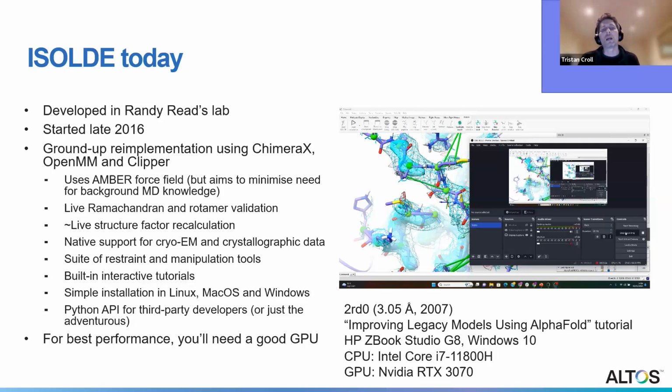And of course, for best performance, because all these simulations do run on a GPU, when I started this project, I was aiming to develop for the hardware that was very high end at the time, which is now fairly commonplace. So you need more or less a good but not great gaming level GPU to get really good performance out of this. Think the NVIDIA RTX 3060, 70 series GPUs.